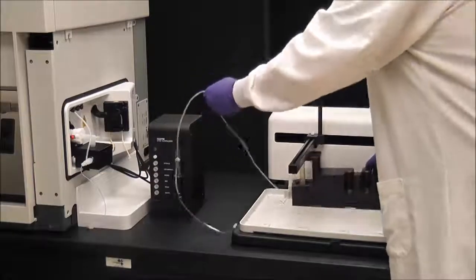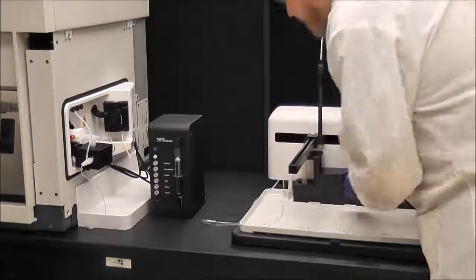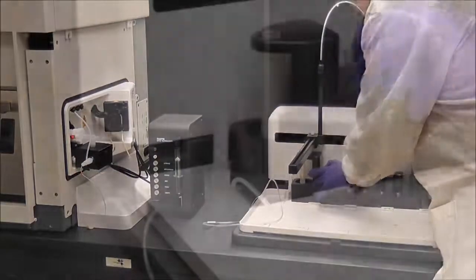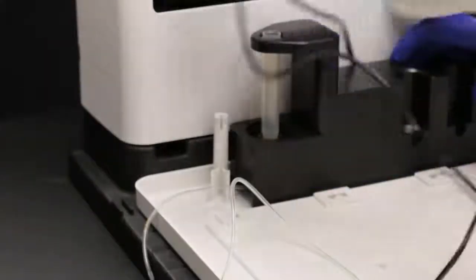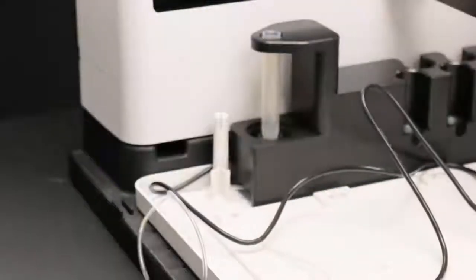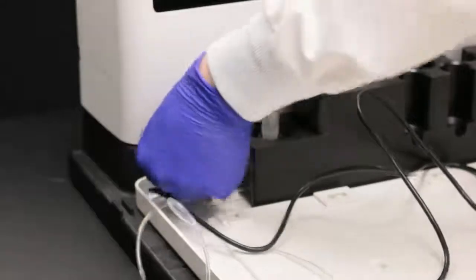Place the vortex module onto the spill tray. Pass the cable behind the vortex module and through the hole at the base of the auto sampler.